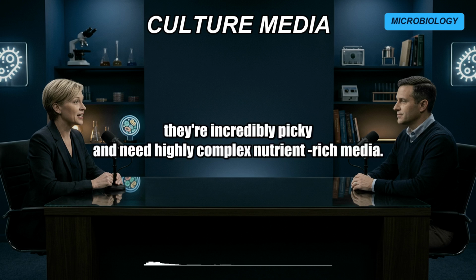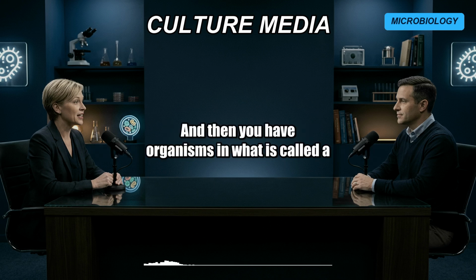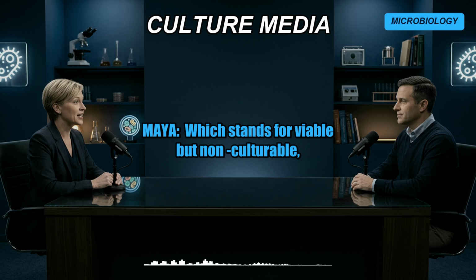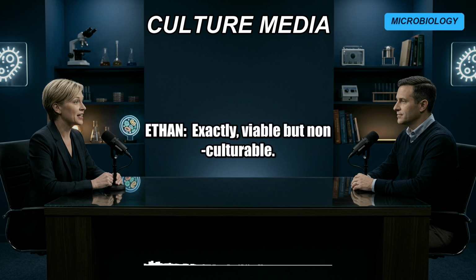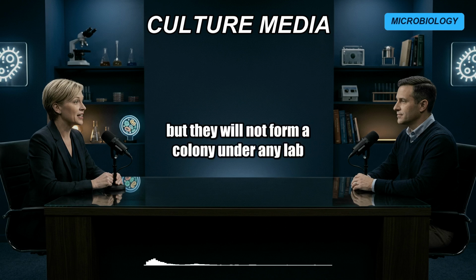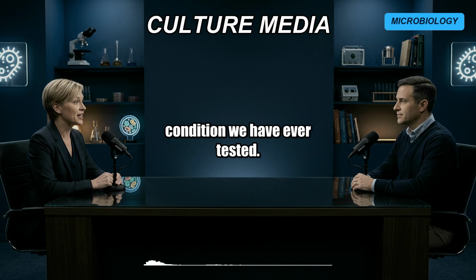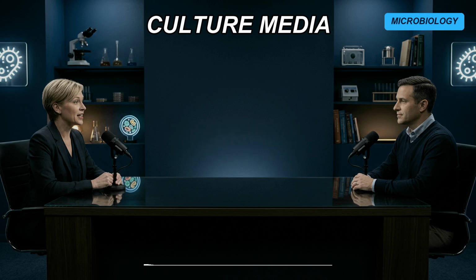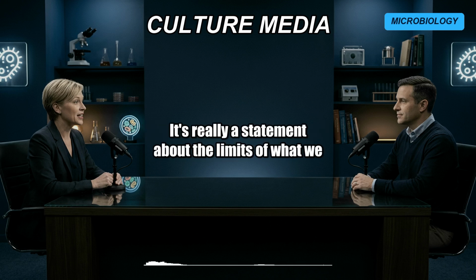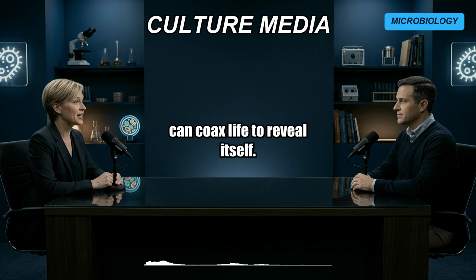Fastidious. It is. They're incredibly picky and need highly complex, nutrient-rich media. And then you have organisms in what is called a VBNC state. Which stands for viable but non-culturable, right? Exactly. Viable but non-culturable. They are alive, they are metabolically active, but they will not form a colony under any lab condition we have ever tested. Wow. So a culture medium is no longer just a recipe. It's really a statement about the limits of what we can coax life to reveal itself.